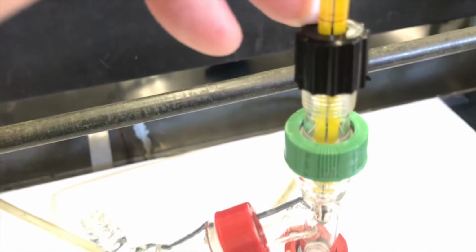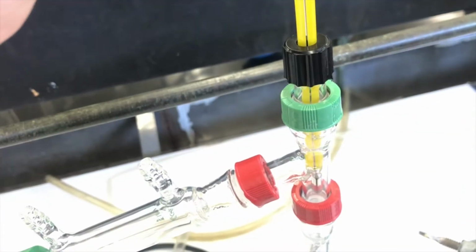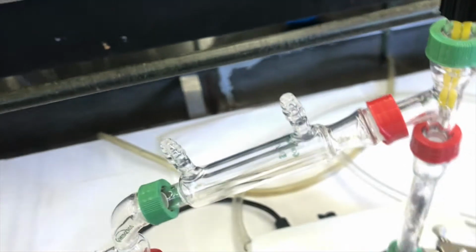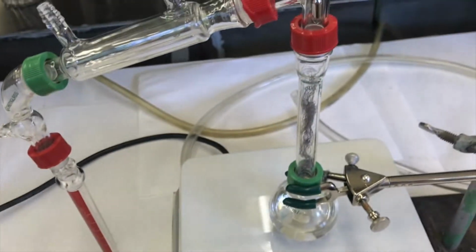So you can see that immersion line. I'll try to put it down in so it will get most all in there. And we're not working with a very large volume of solvents, so this won't be completely coated with vapor dripping off of it, so you're not going to get as accurate a reading, but that's okay. We're still going to get some data there, and then we're going to run our samples through the GCMS and get really good data that way. Oh yeah, and then we're going to monitor the temperature here. Can you see there, it's warm in the lab today. We're almost at like 30 degrees Celsius in here.